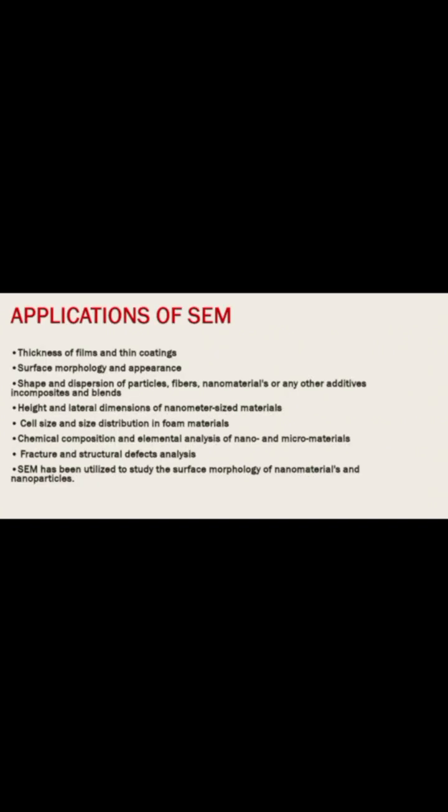Applications of SEM: thickness of films and thin coatings, surface morphology and appearance, shape and dispersion of particles, fibers, nanomaterials, or any other additives in composites and blends, height and lateral dimensions of nanometer sized materials, cell size and size distribution in foam materials, chemical composition and element analysis of nano and micromaterials, fracture and structural defect analysis. SEM has been utilized to study the surface morphology of nanomaterials and nanoparticles.